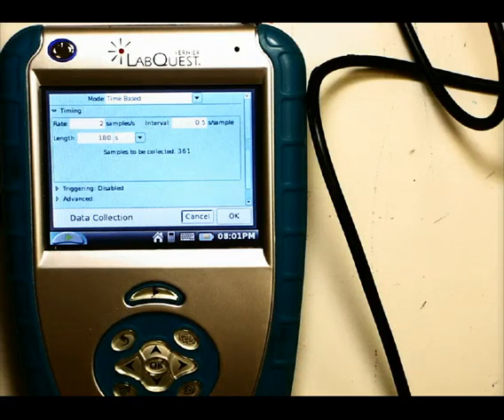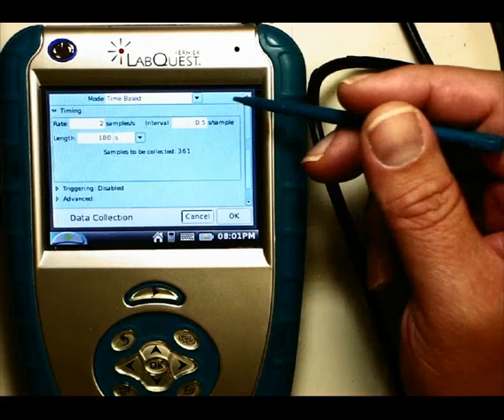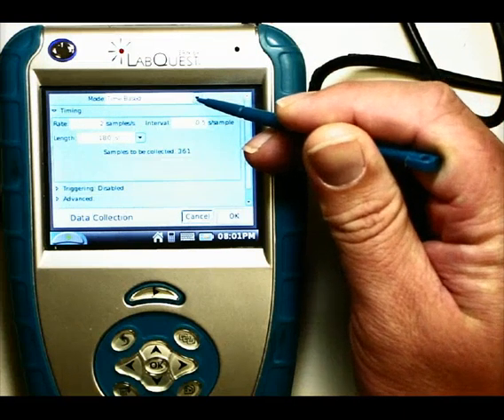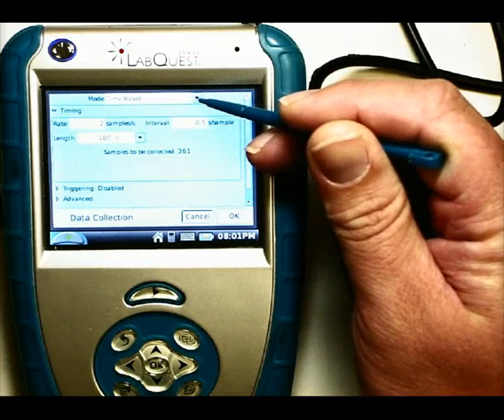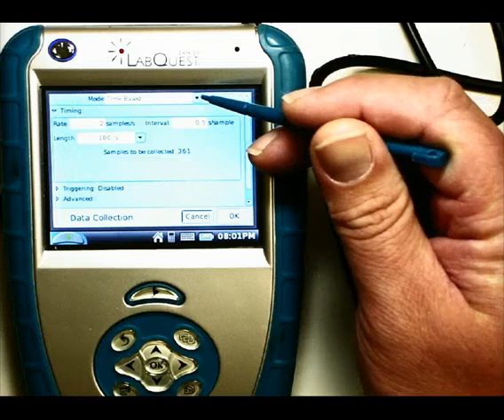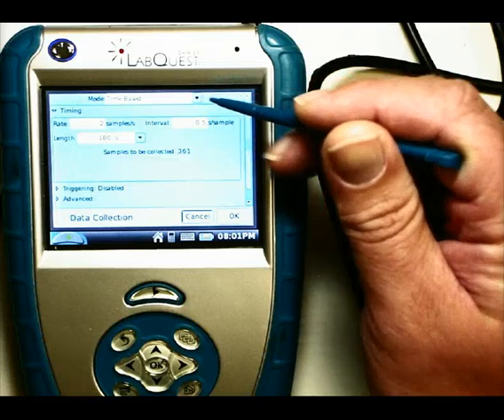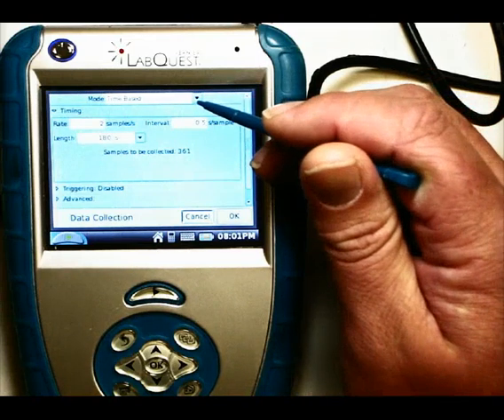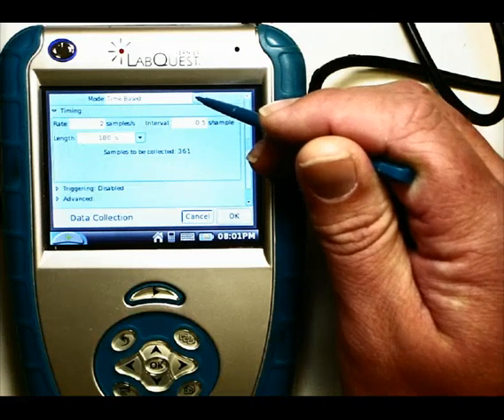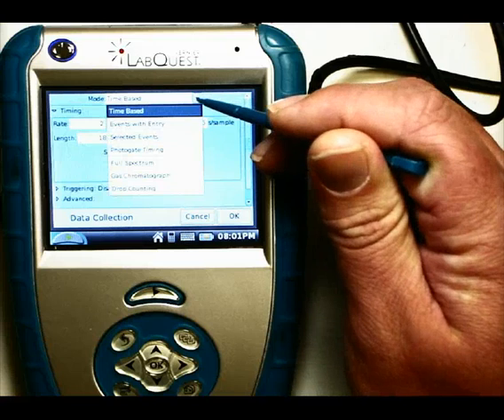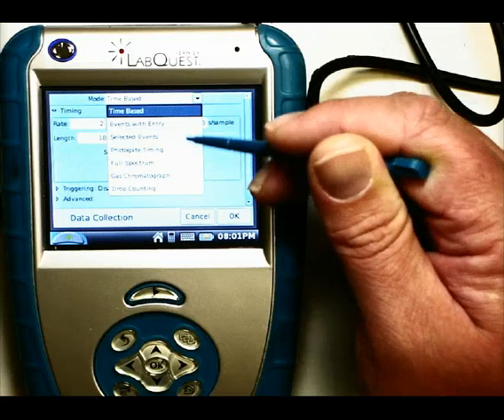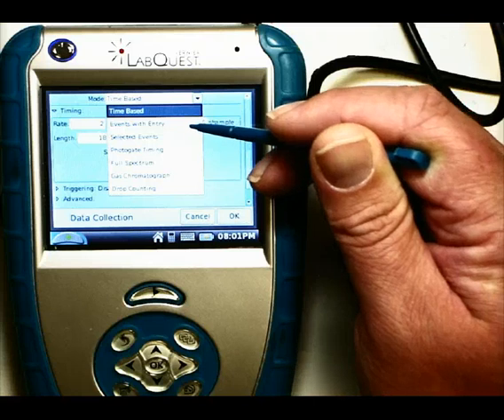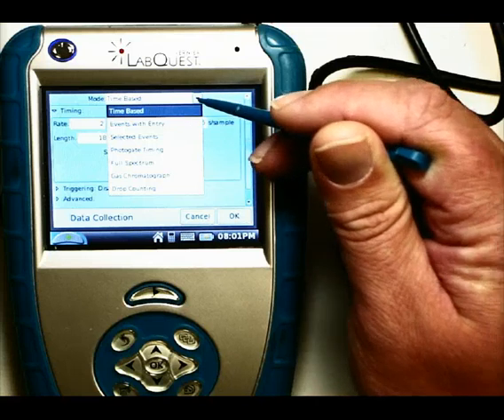Now in this screen there are some options. Let's start at the top with Mode. The first mode is Time Based, and what this does is tell the LabQuest to take data from the thermometer — or whatever instrument is connected — a certain number of times each second. The only other mode you'll probably ever come across is Events with Entry, but we'll jump off that bridge when we get there.